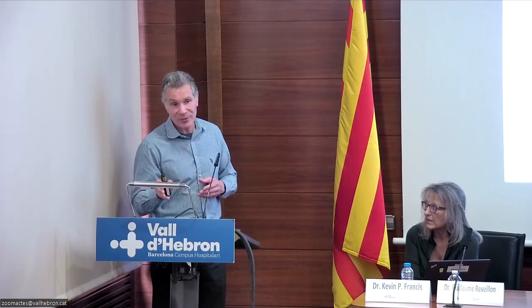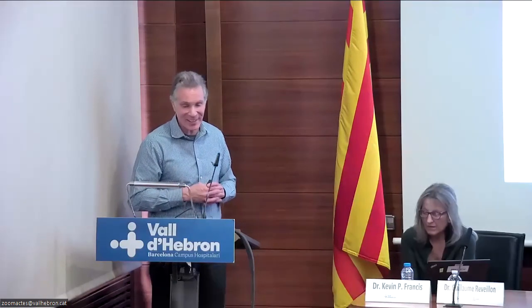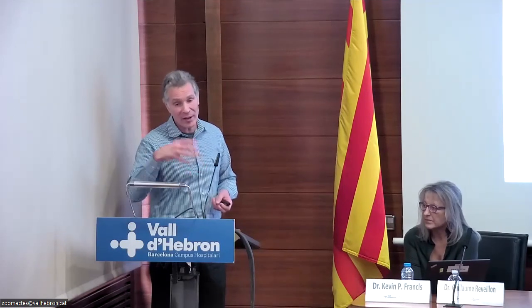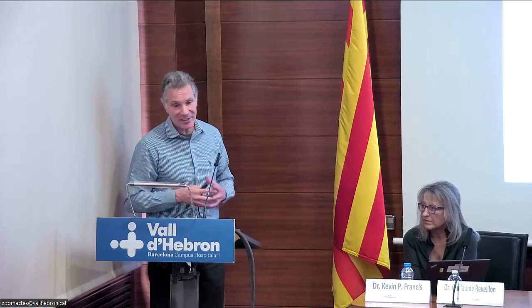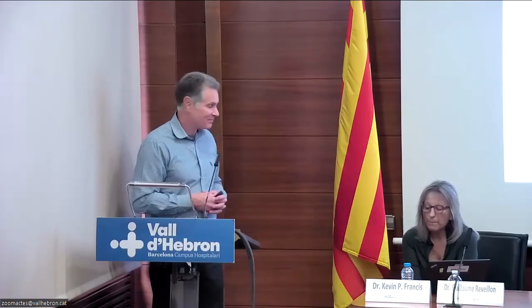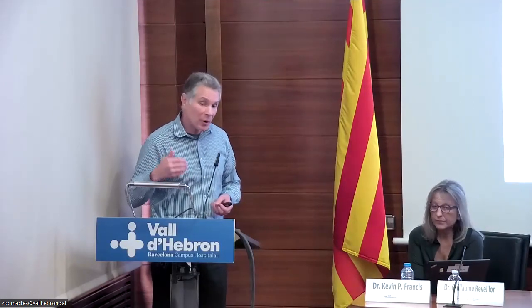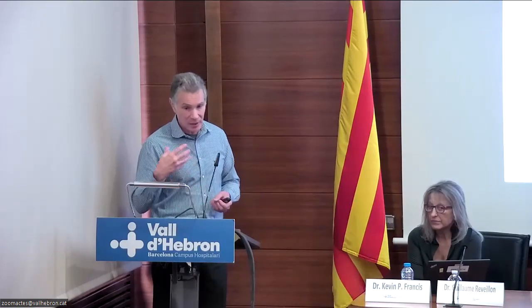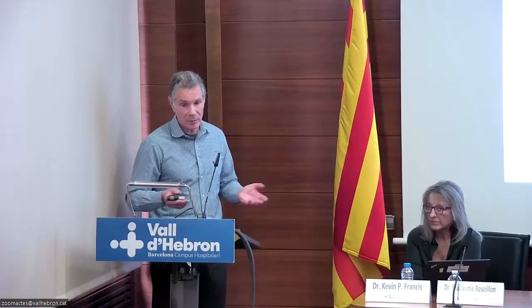We used to sell a system called the Kinetic, which had the same camera, but nobody bought it, so we stopped selling it. It would be quite easy to unbolt one camera and put the other camera on, and then it would work like an ICCD or an EMCCD. But the reason I was showing that image was that I wanted to show you what's possible using the luciferase. The luciferase is so bright, it shows what's possible even in a large animal using biophotonic imaging.